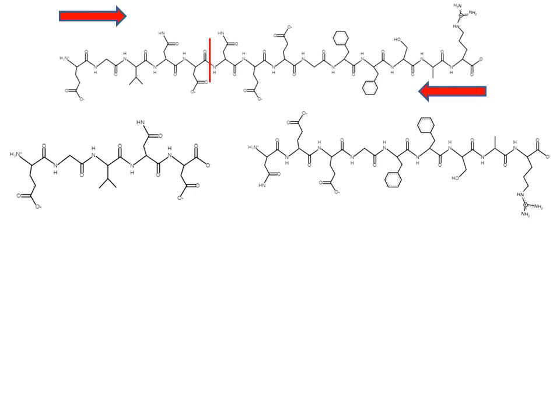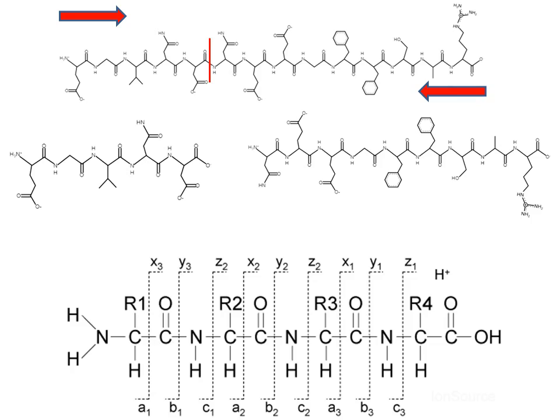The shorthand way of assigning peaks in a spectra to an amino acid bond is to define the B and the Y ions. If the peptide molecule is broken through the peptide bond, the N-terminal fragment is called the B ion, and the C-terminal fragment is called the Y ion. It should be noted that the numbering occurs in opposite directions. For tryptic peptides, the Y1 ion, or the C-terminal amino acid, will be an arginine or a lysine.